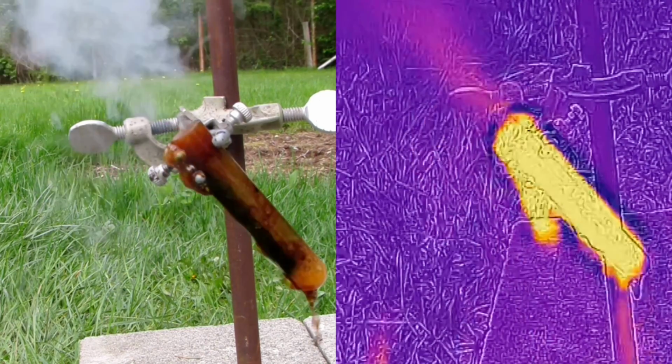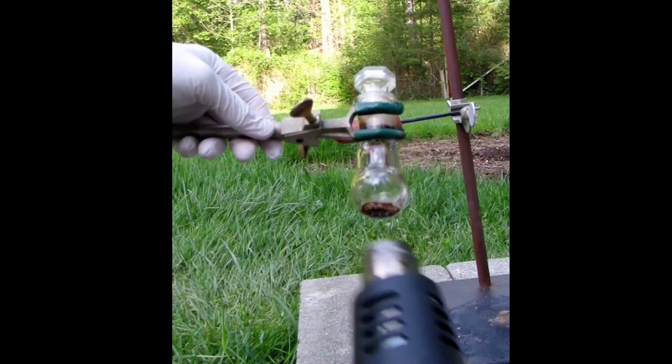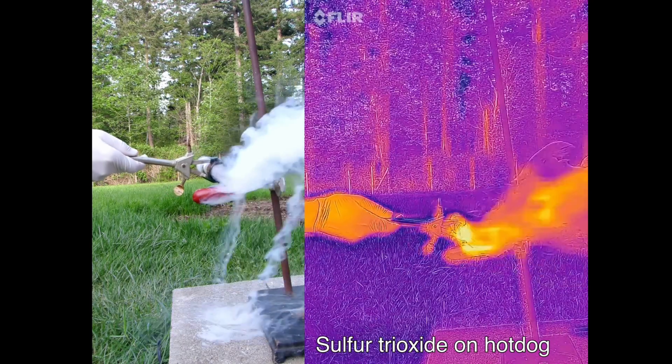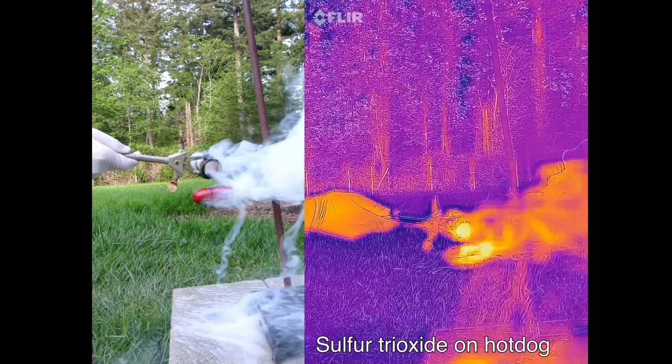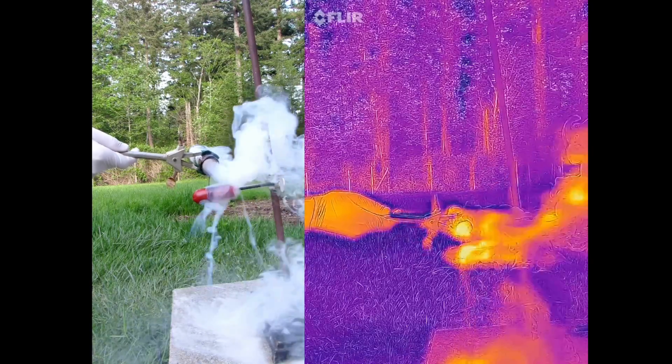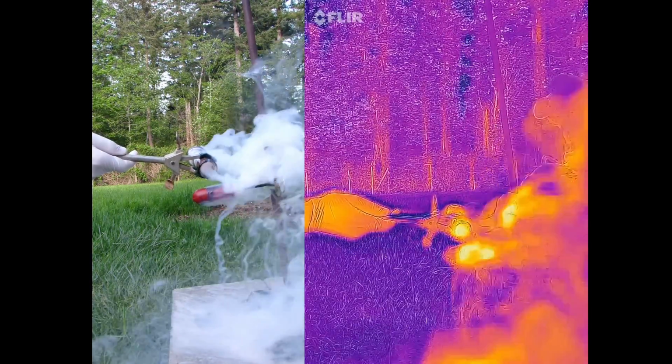What about dumping some sulfur trioxide on a chunk of hot dog? Well, I certainly wouldn't want that to be my finger. Those large plumes of sulfuric acid vapor also definitely warrant the use of a gas mask and goggles.